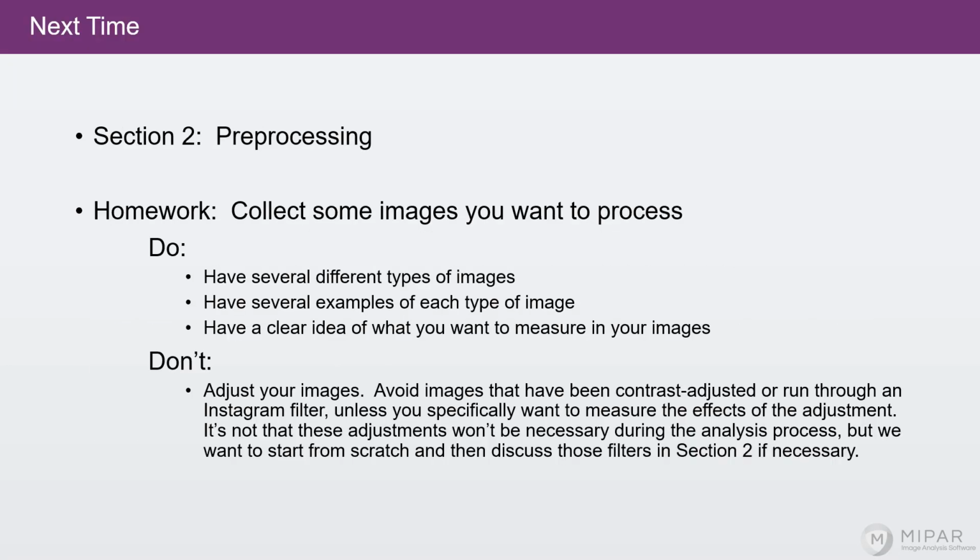Next time, we'll start section 2, which is pre-processing, and dive deep into grayscale manipulations of your image.